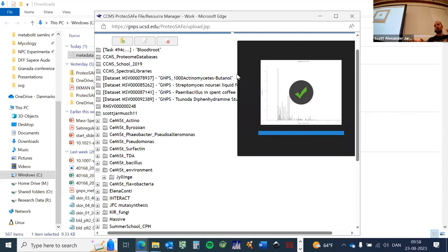So now, obviously, you may ask, what are we doing if we have files that are larger than 20 megabytes, especially dealing with the raw MZML files? That's typically the case. So then we recommend using an FTP client, such as WinSCP or FileZilla, to actually upload this. It's a little bit more practical to use, but for time's sake and ease of use, we just quickly use this web interface because it doesn't require you to install anything. WinSCP is a little app. I saw many people had it already installed, right? So you can quickly install it. It's open source. But if you do not want to, you can also use this web interface.